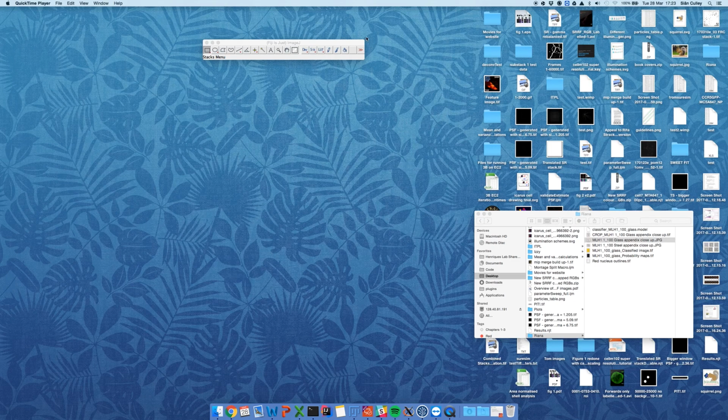So what I'm going to do here is just a screen recording of opening an image, calibrating it, doing the Weka segmentation and analysing the particles. It's probably going to be incredibly cringeworthy because I've never done a commentary Fiji video before. So let's see how it goes, and feel free to laugh when I inevitably crash my computer or start swearing halfway through. So I'm going to open the glass image here.